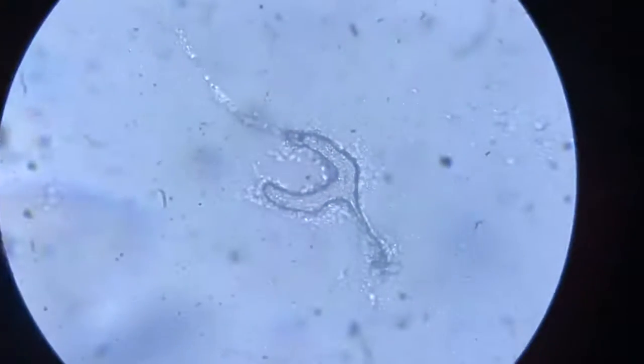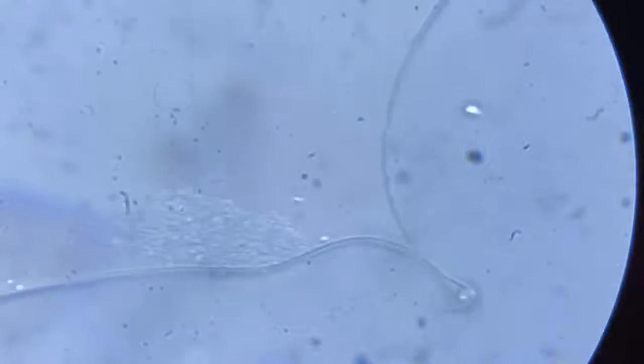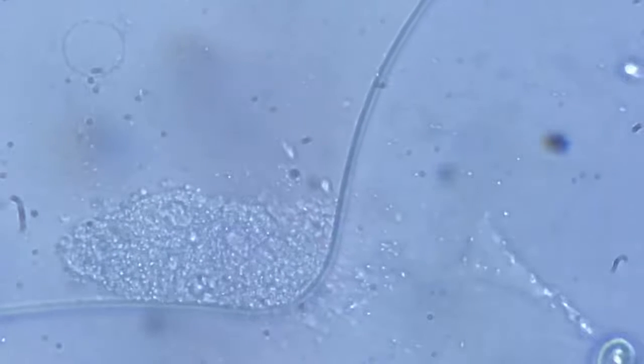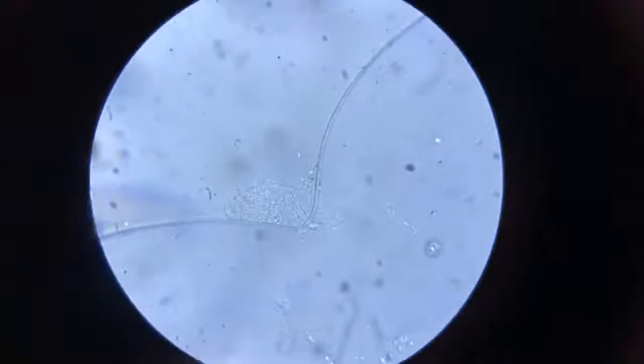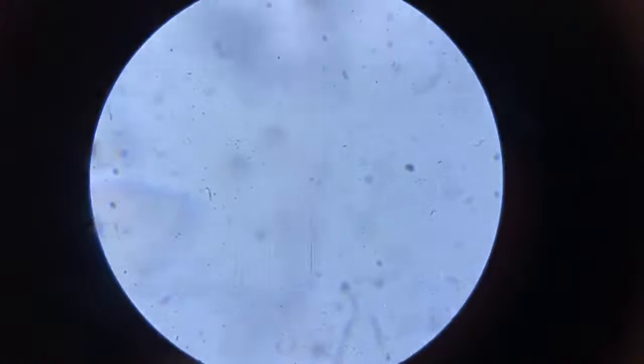We'll quickly jump over to another section and see if we still have some water film and some organisms left. Water was receding. Here it is. Another one. Another fellow committed suicide. Another dead organism. They have somehow got the idea. Any others left?